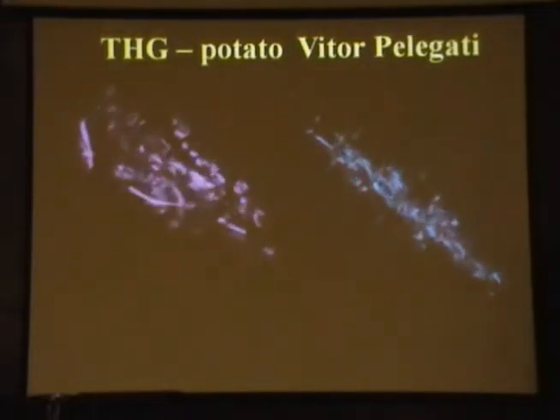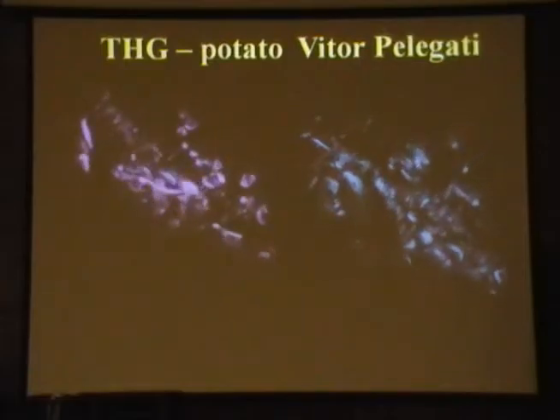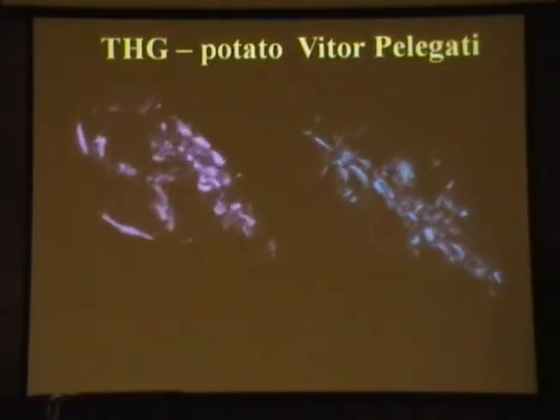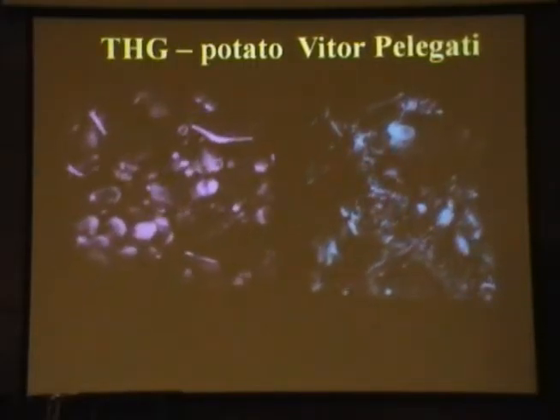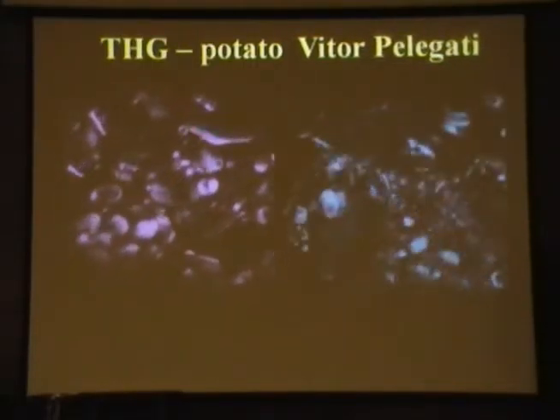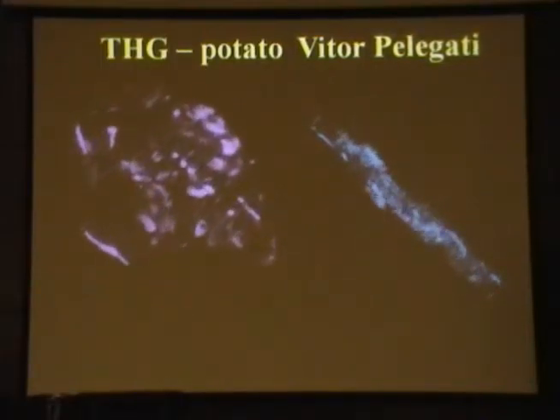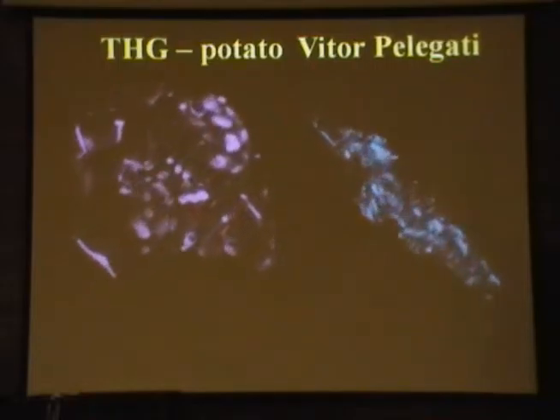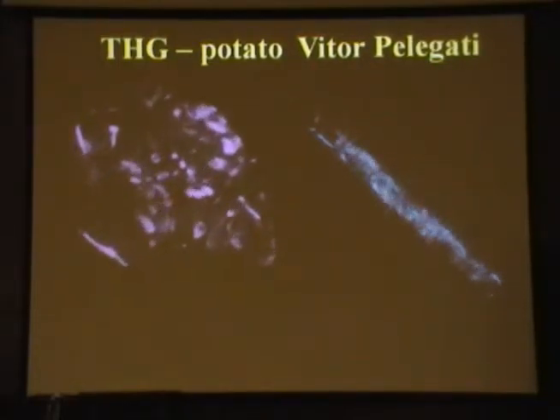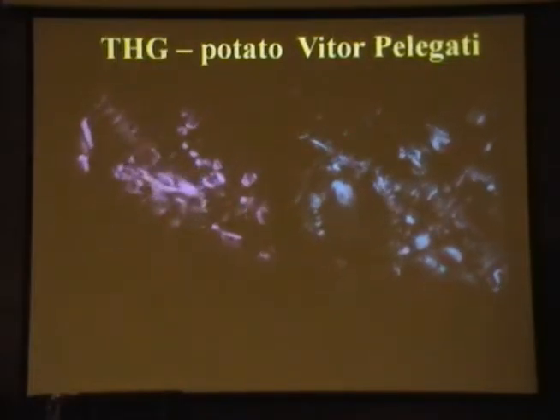So that's the potato. Potato is nice. If you want to see if your system is able to detect anything, take just a piece of potato at your first shot that you have, and that will generate second harmonic, third harmonic, and autofluorescence. And buy the cheapest potato you can. Do not buy organic potato. They have less autofluorescence. Buy the one with lots of chemical in it, and then you can have everything.